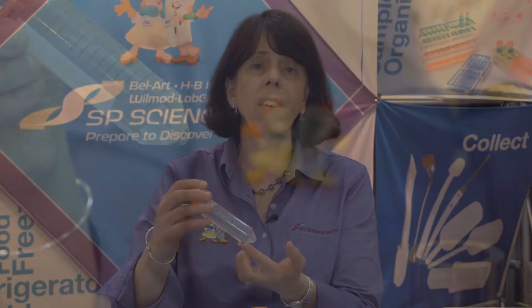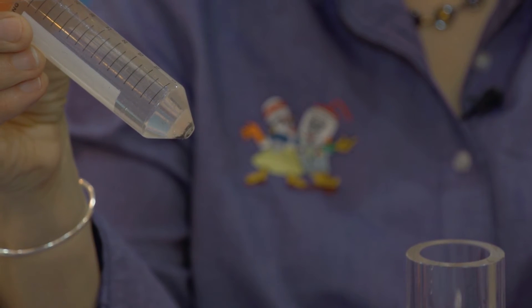Magnetic beads are super paramagnetic polymer particles. They're uniform in size and have a defined surface area. This allows for reproducibility and also minimizes chemical agglutination. Because they're so small they can be difficult to see on camera, so for purposes of our demonstration today we're going to be using some magnetic filings which are quite a bit larger in size.